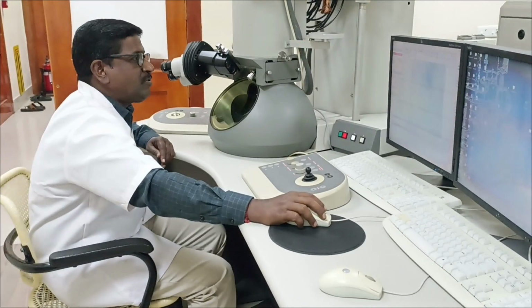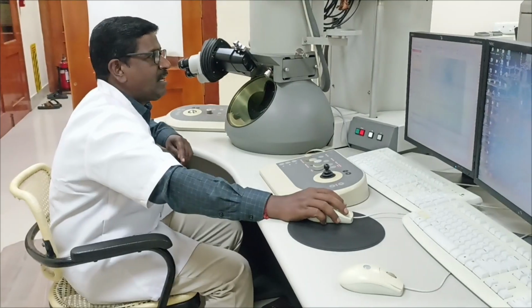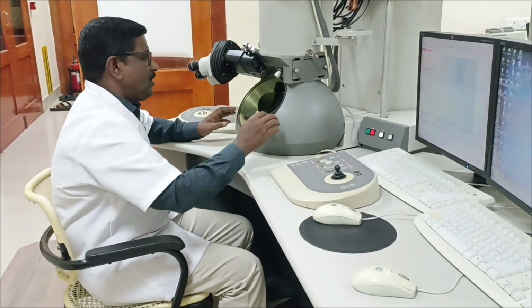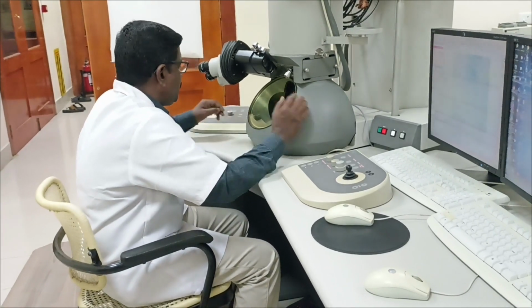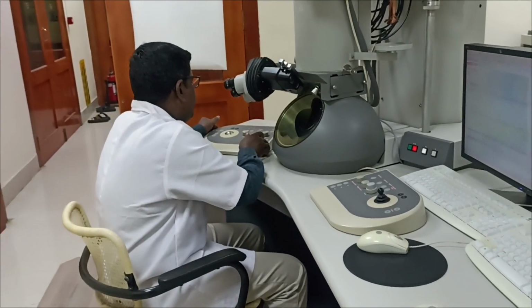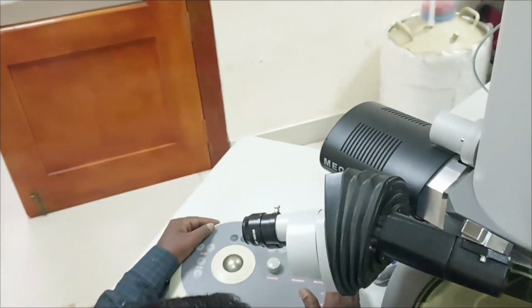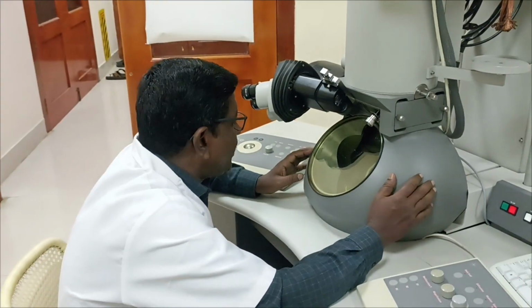After that we have to set the required parameters. It means that we have to set the vacuum and the other required parameters. After that, the beam will be projected over the fluorescence screen, and using this panel, that is the intensity panel and the left and right panel, we have to adjust the beam, after capturing the image by the camera.